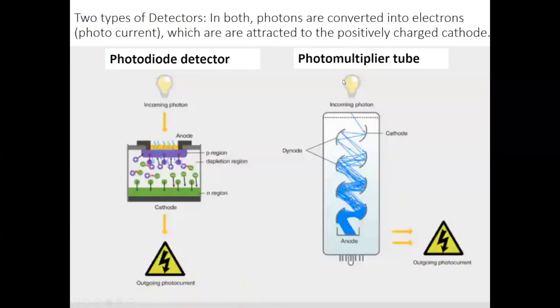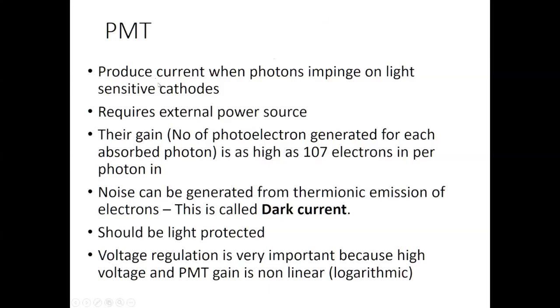Whereas a photomultiplier tube is used to capture weak signals like your side scatter and fluorescent signals, because it has the inherent capacity, when you give electric current to the photomultiplier tube, to amplify the photons and generate signals. So even if one photon impinges, it can multiply and make a considerable signal. Whereas if just one photon hits the photodiode, it doesn't even register that. So that is the reason for weaker signals you use a photomultiplier tube, and for stronger signals you use photodiode detectors, right?